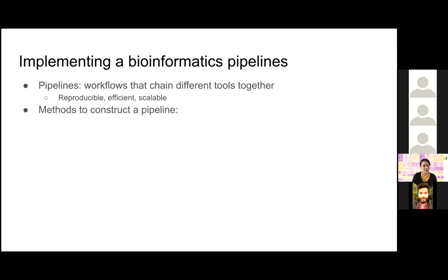Now, there are different methods to construct such a pipeline. If you use these command line tools or use R packages, you could attach these different steps together using essentially any programming language. Any language would do. Certain languages are better than others in terms of writing a pipeline. For example, I personally think Python is way better than R in terms of putting together a pipeline.